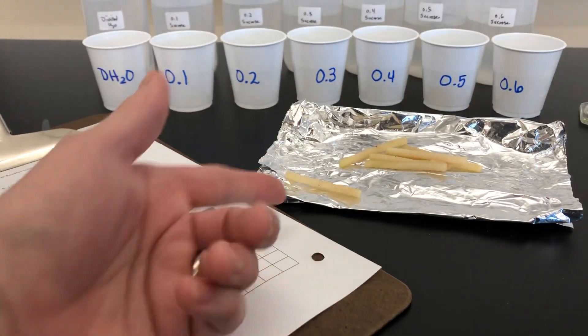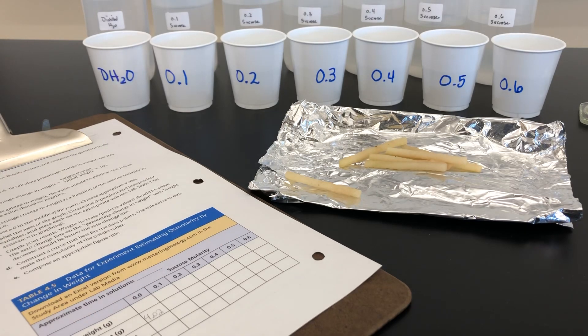After they were bored, they were cut to 5 centimeter lengths. We will weigh each piece, record that weight in Table 4.5, cut it in half lengthwise, and then place it in one of the cups.